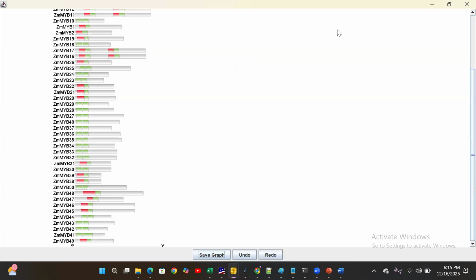Sir, I have one simple question. In the motif finder, there were two red regions, but you selected only one region, if you remember. Why is that, sir? Because both have the same sequences, so we just select only one. No problem at all. But we can select the other as well. Maybe there might be a change in the number of sequences, but I just assume that they both have the same sequences. Okay, sir.